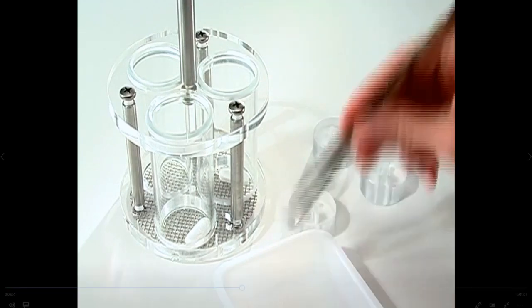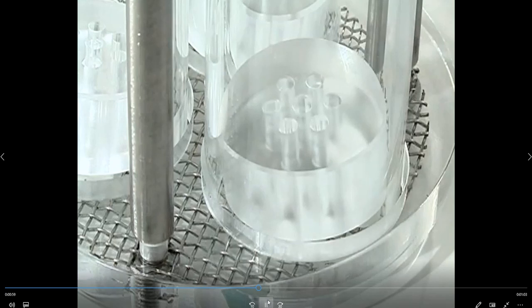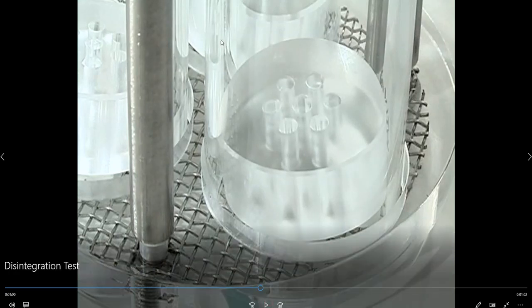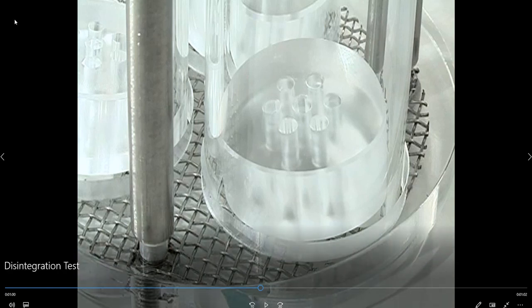Now in this basket, it's very strange because you see only 3 tubes. Now you use this basket only when the dosage form that you have is maybe large and it cannot fit well in the 6 tubes station.